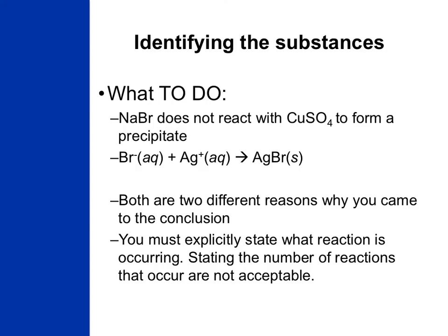Remember, you need to explicitly state what happened with your solution or what you observed with a particular solution. Simply stating the number of reactions that occurred without details about what happened is not going to be accepted.